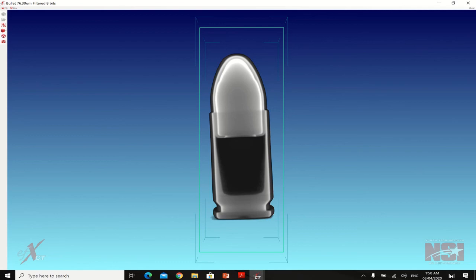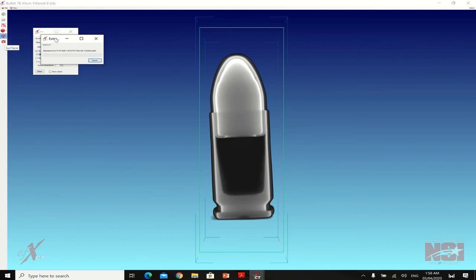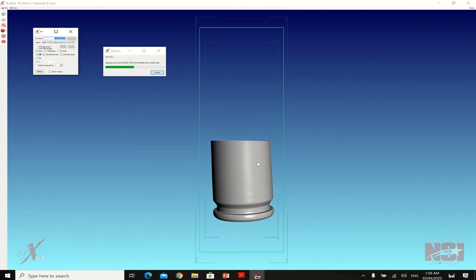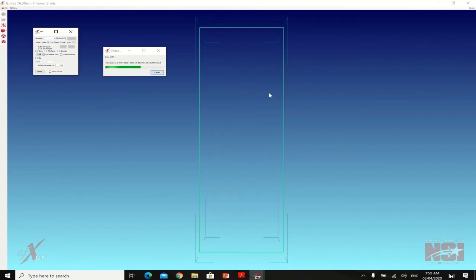we'll have the isosurface. So when doing the isosurface, it is relatively like solidifying your sample, but on a surface scale. What I mean is that using the ISO value, you are solidifying your generated 3D volume, but in a sense, the surface. Okay, so to make it faster, you just unclick the show, so it will do it much faster.